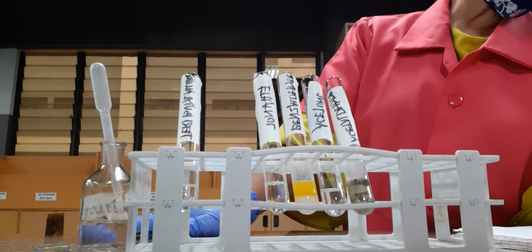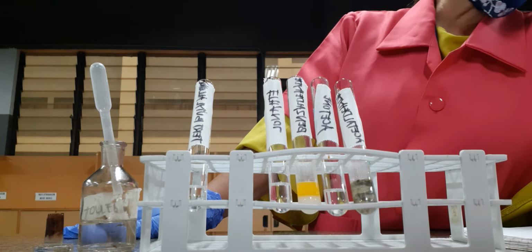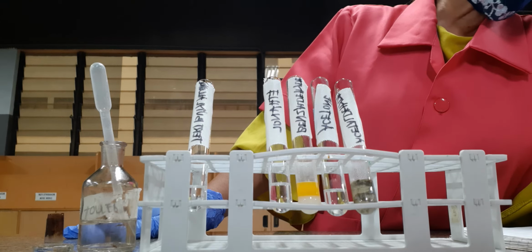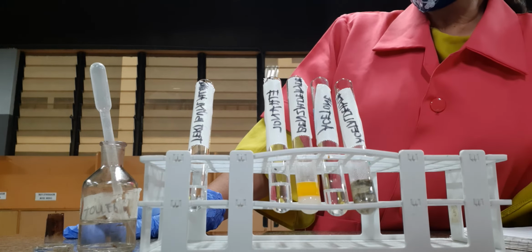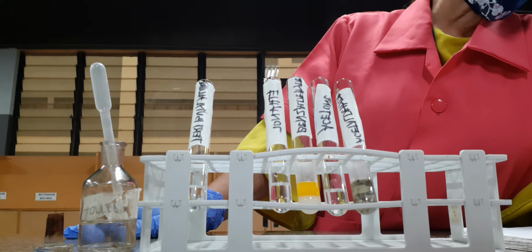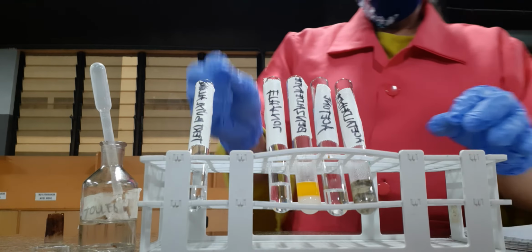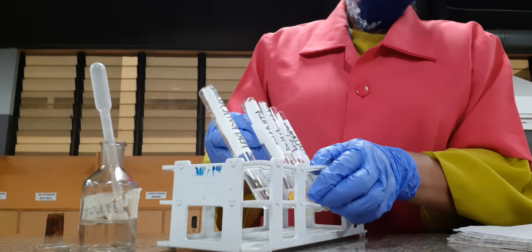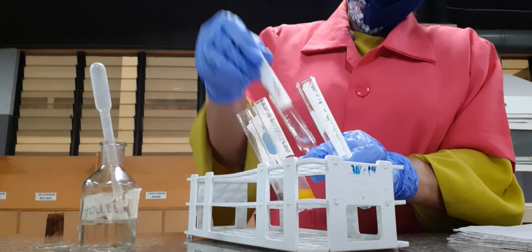Warm in water bath. So we're gonna warm this in a water bath, okay? And observe whether it will generate a different color and will it result to a precipitation. Okay? So we have benzaldehyde. We will shake this one first.